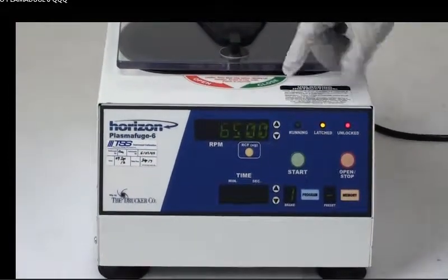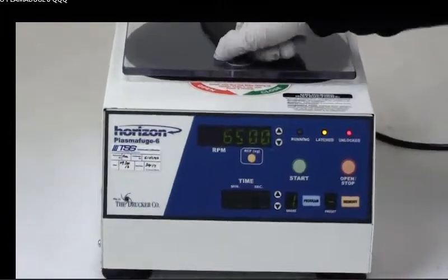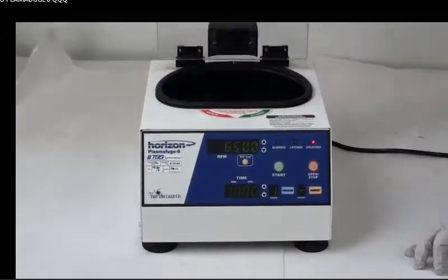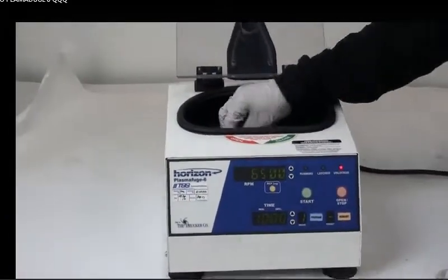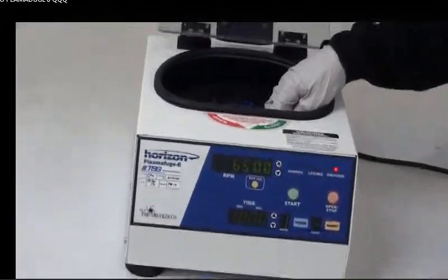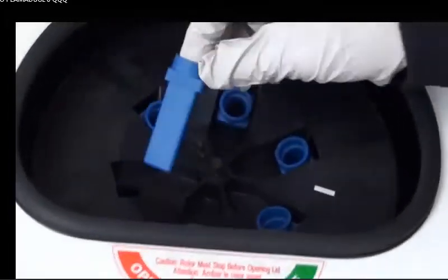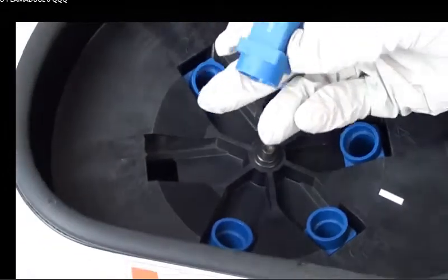It's completely stopped. The alarm will go off and you'll see the little red unlock button. Let's open the latch and then I can show you that there are six cylinders in here, and they are in great condition, almost new and original.